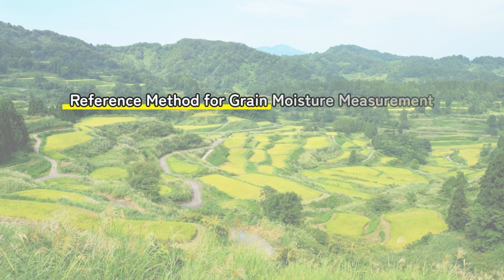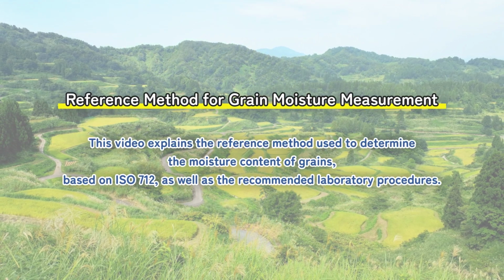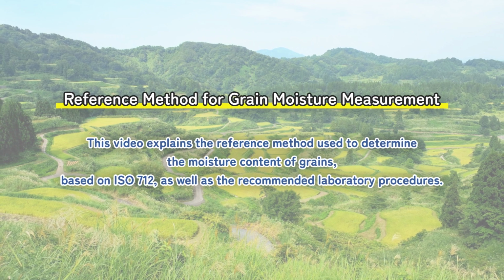This video explains the reference method used to determine the moisture content of grains, based on ISO 712, as well as the recommended laboratory procedures.